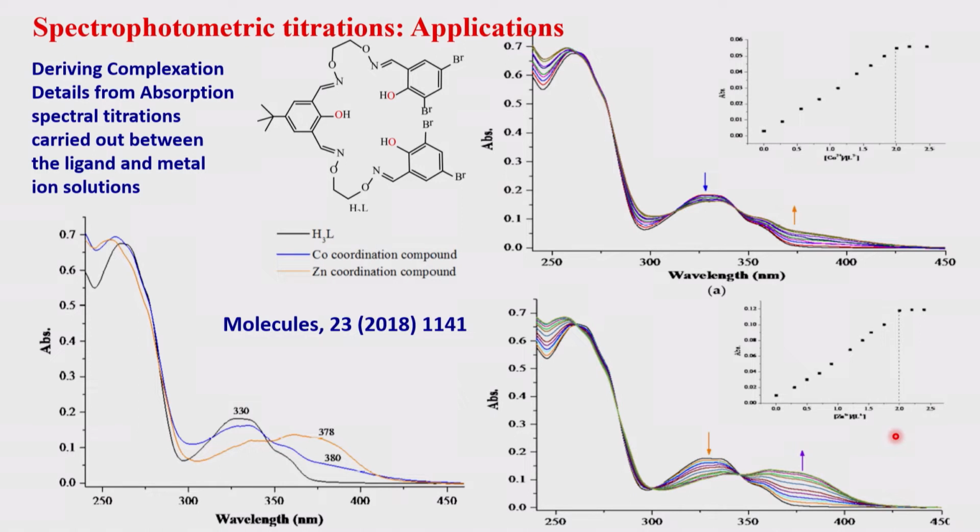So that means you can establish the complexation, and from the structure of the ligand you can build the possible structures of the complex as well. Though these spectra do not directly imply the structure, the structural implications can be derived by comparison, because the intensities are not so high. So that means they are forming some kind of octahedral type of complexes.